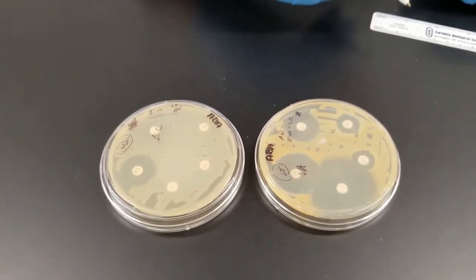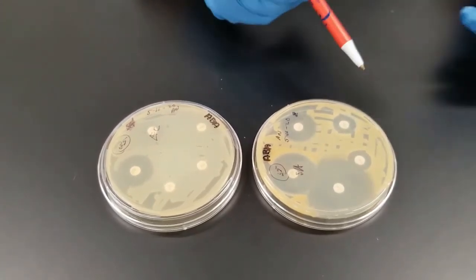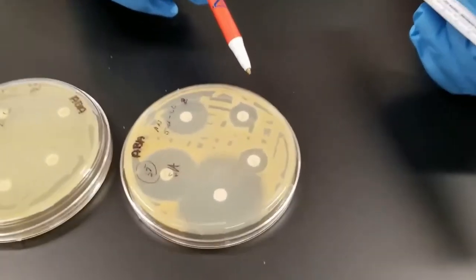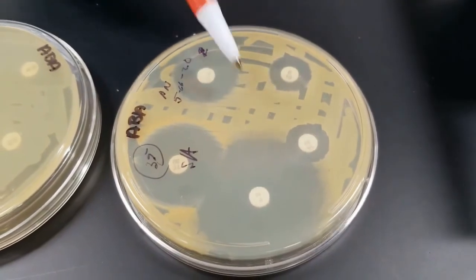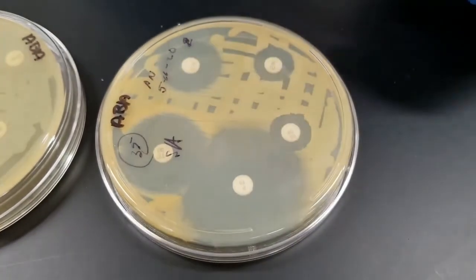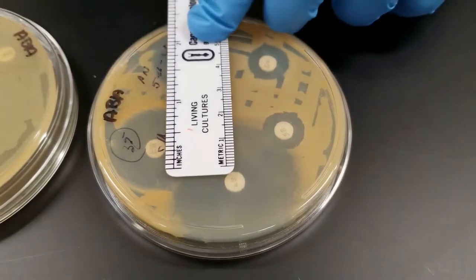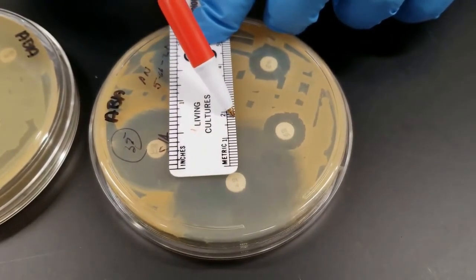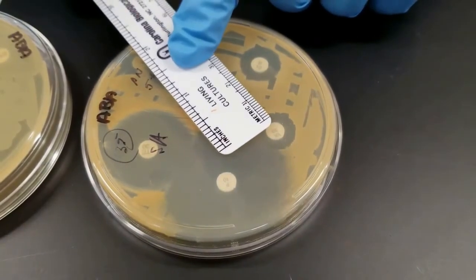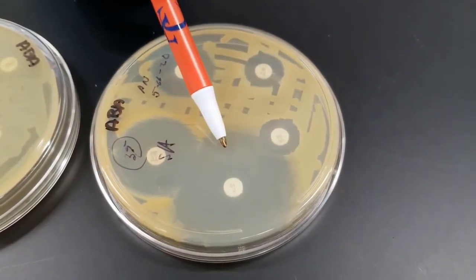Oftentimes what you're doing when you're comparing different antibiotics is seeing, is there a zone, and then comparing between the different antibiotics. If there is a zone, how do they compare to each other? And you can actually measure. If you look at the Staphylococcus aureus, we tested 5 different antibiotics. All 5 were inhibitory. Now if you look over here at this one, which is penicillin, we can actually measure from the edge of the disc to the edge of that zone. And it looks to be about 12 to 13 millimeters as compared to over here, the VA's vancomycin, and that's about 3 millimeters in distance of the zone of inhibition. So the greater the zone, the greater the effectiveness.